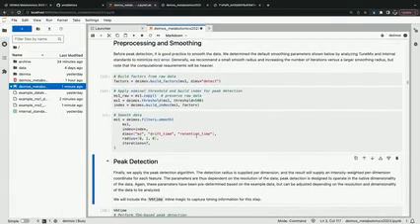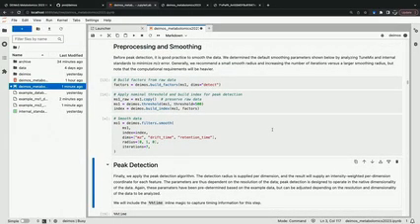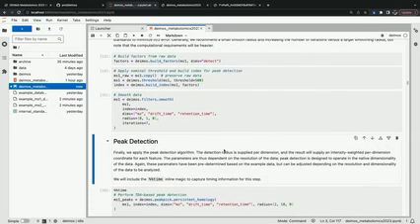Something we'll note here about the parameter sets is we did test a variety of different parameter sets for smoothing, and we found in general that increasing the number of iterations for smoothing and keeping a small smooth radius tended to perform best, but does eat up more computational resources, and so there's that trade-off there.